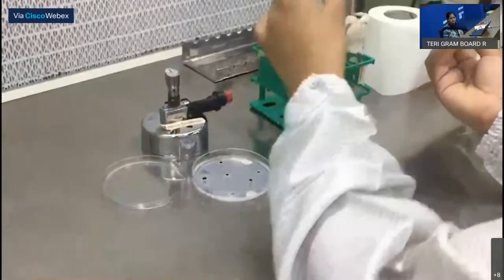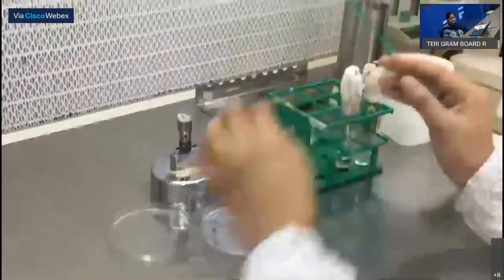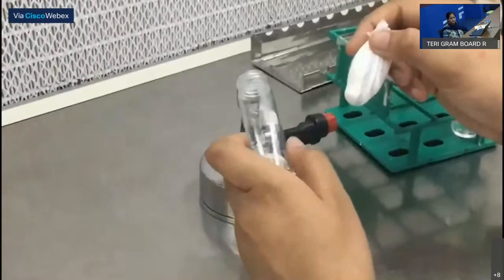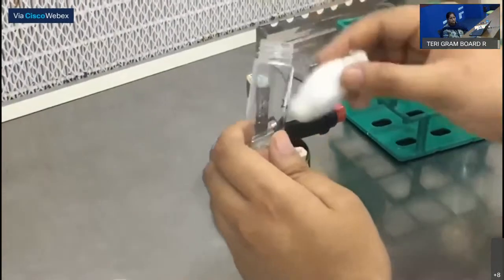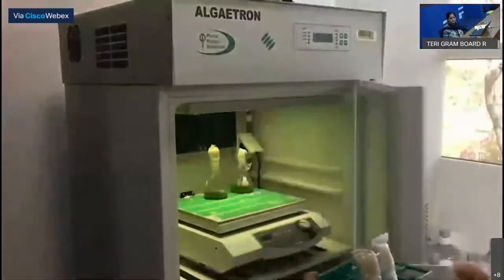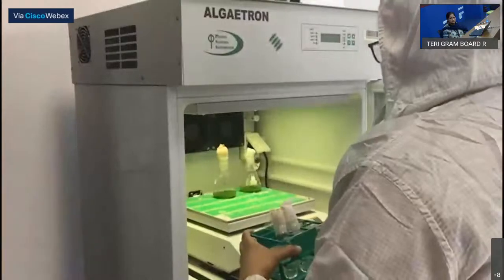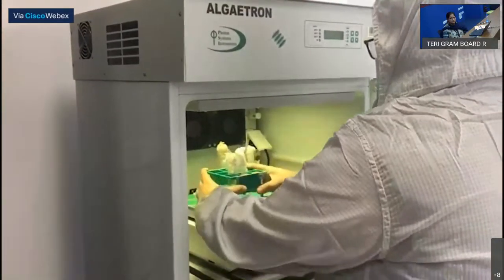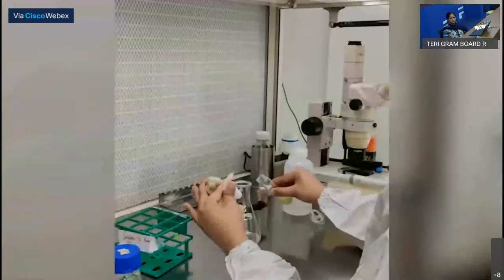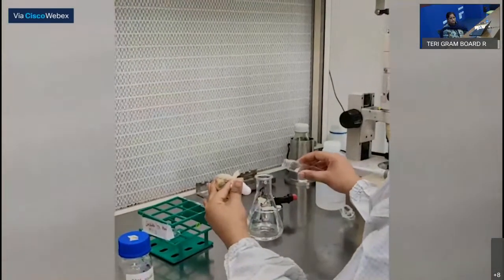Once colonies appear, a single colony is picked and inoculated into 2 ml of media broth and kept under controlled conditions until the colony grows. Further, the cultures from 2 ml are upscaled to 70 ml for growth kinetic studies in Multicultivator for bioprospecting.